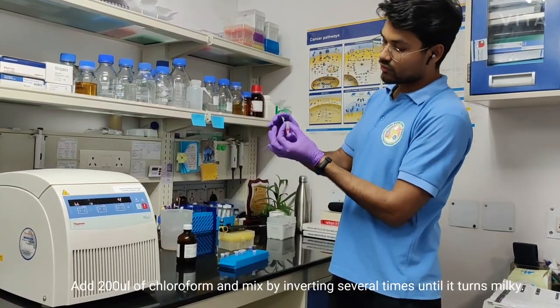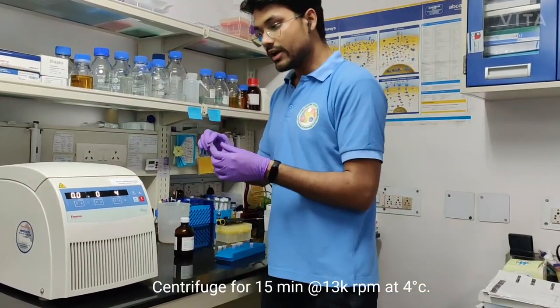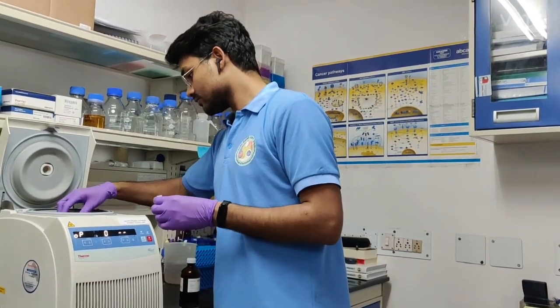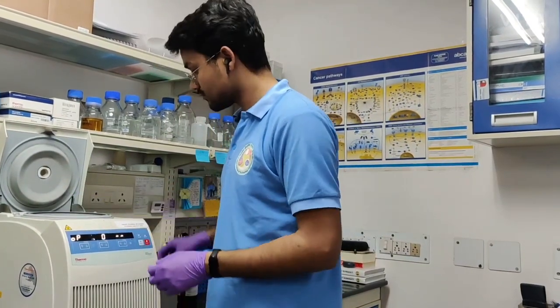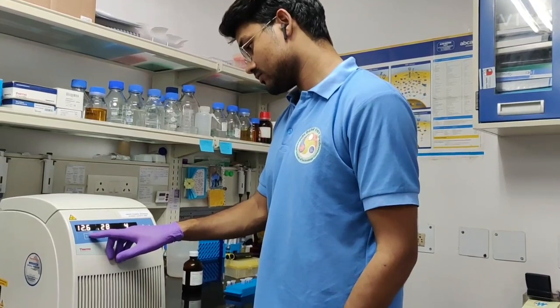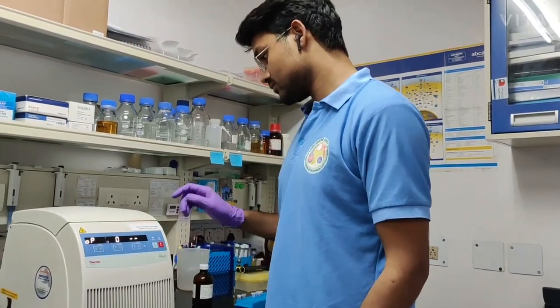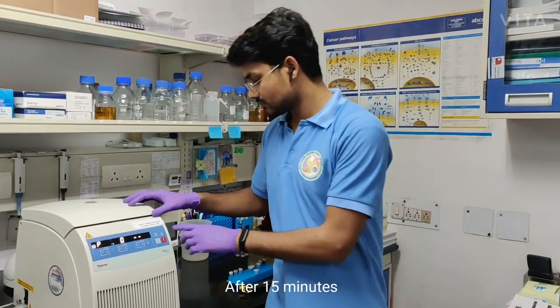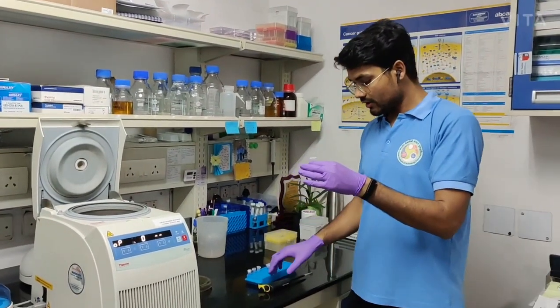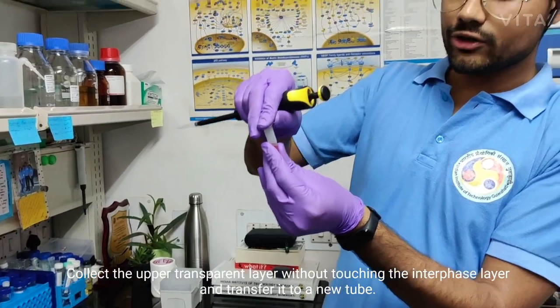So I have added the chloroform, then I will gently mix the solution until it turns milky. After that I will centrifuge it at 4 degrees Celsius for 15 minutes at 13,000 RPM. Now the centrifuge step is done. We will collect this upper transparent layer without touching the middle interface layer and transfer it to a new tube.